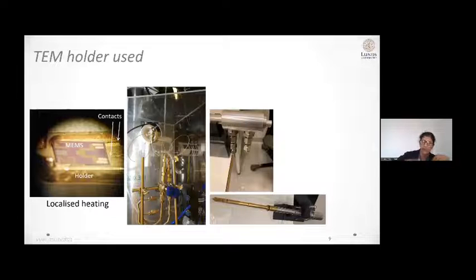So when you change from one temperature to another temperature, it might take maybe half a minute or so to stabilize, but actually not even half a minute, in maybe 2-3 seconds you see a drift and then it stabilizes. So it's much easier to look at any in-situ heating experiments with this kind of system. And the total IR radiation that you get due to the sample heating is also much smaller, which is why we can get some of the results that I will show you in the following few slides.